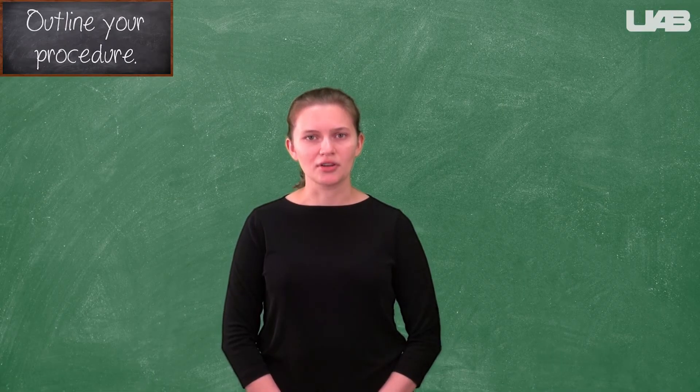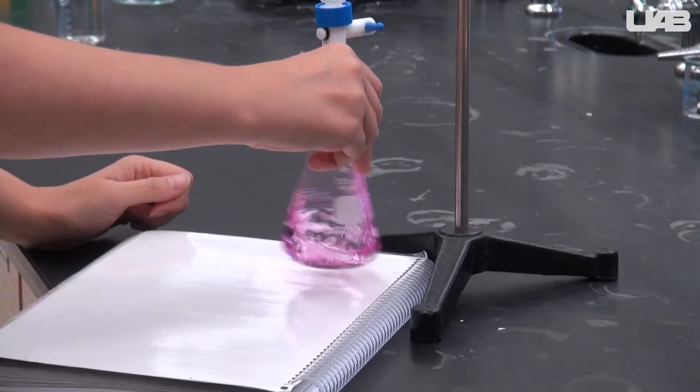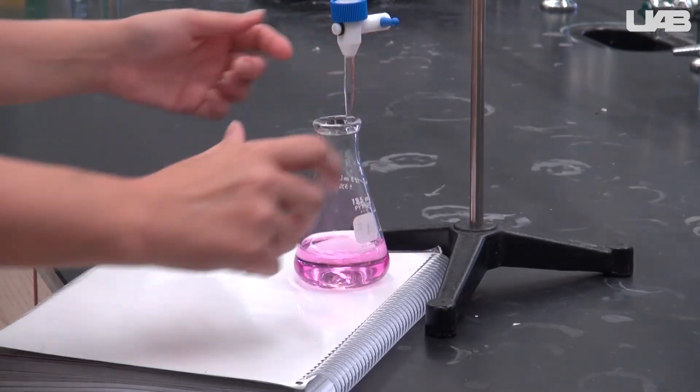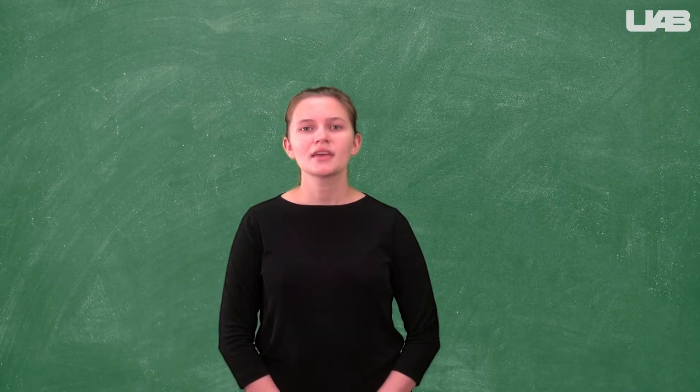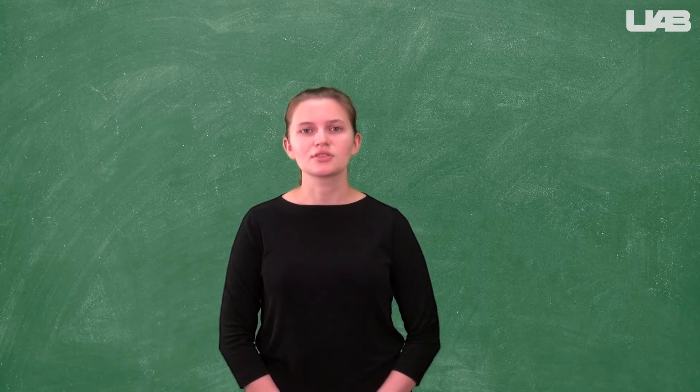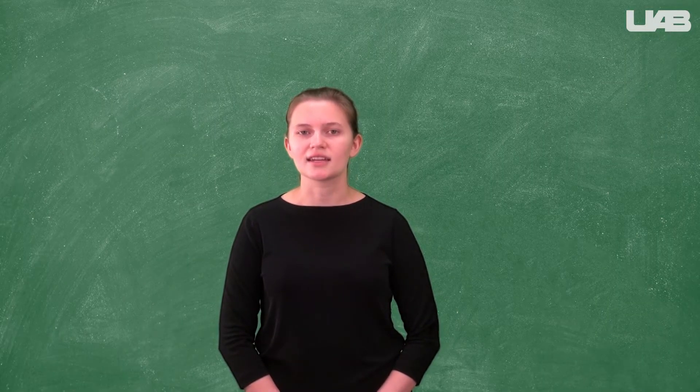Record the final volume in the burette. If you let it go too far, it will turn a very bright pink. You should redo the titration if it looks like this at the end. You will repeat this procedure until you and your TA decide that the data is precise.